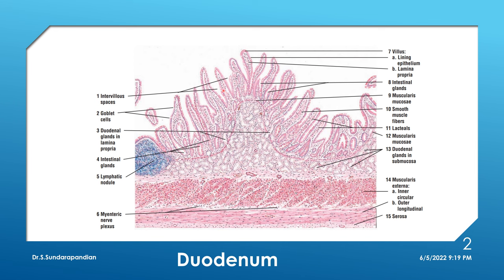That is the feature of mucosa — we are able to make out numerous villi. Now the striking feature of the submucosa in duodenum is the presence of glands. These glands present in the submucosa are called Brunner's glands, also known as duodenal glands. In the identification we have to write: submucosa with Brunner's glands.